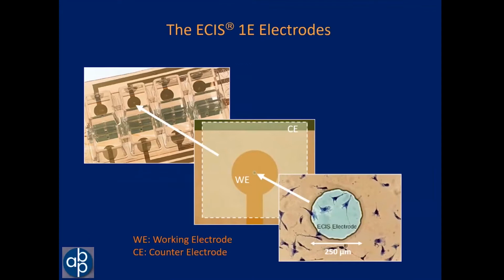The heart of the measurement, of course, will be the electrodes that are in tissue culture wells. Here we're looking at an 8-well array, which you can see in the upper left-hand panel. In the center of each well is a small 250 micrometer dot, which is the active electrode. A counter electrode labeled CE completes the circuit. This is a very small electrode, but it can monitor anywhere from a single cell up to a confluent layer where maybe 50 to 100 cells can crowd onto this electrode.